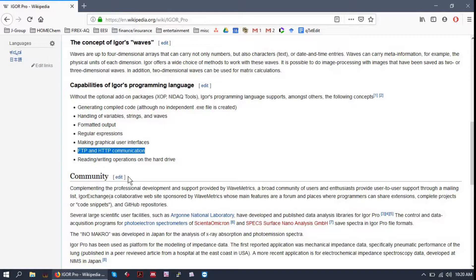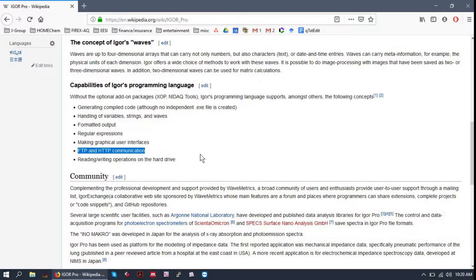You can even do FTP and HTTP communication with Igor. So if you have some sort of server that you are storing your data or uploading your data to, you can integrate it with Igor.